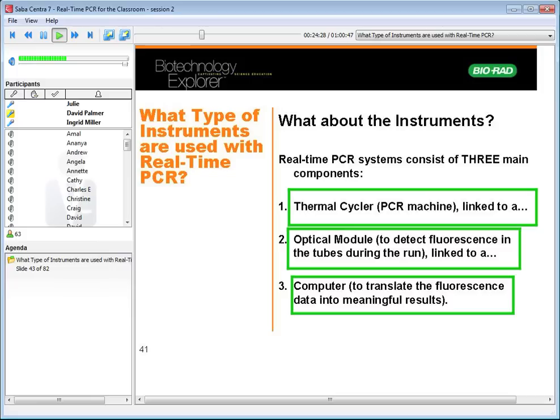what you do is you do PCR on some supplied DNA samples. You've got different suspect samples and a crime scene sample. You can run the PCR products out on an agarose gel and see the band patterns and match up the suspect with the crime scene sample.